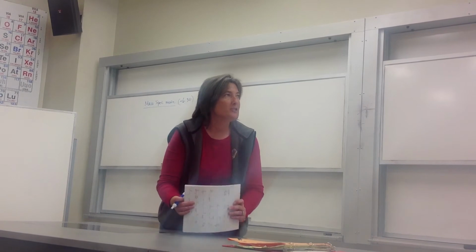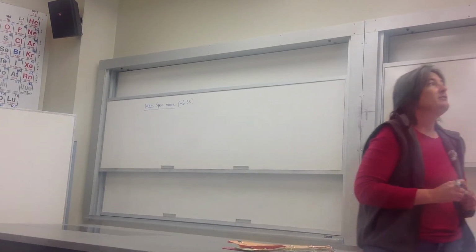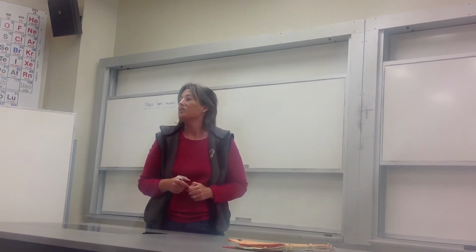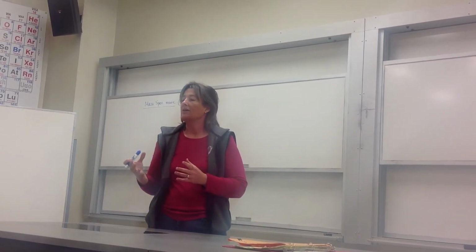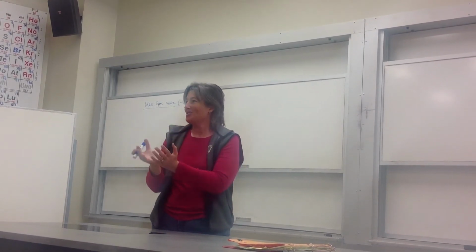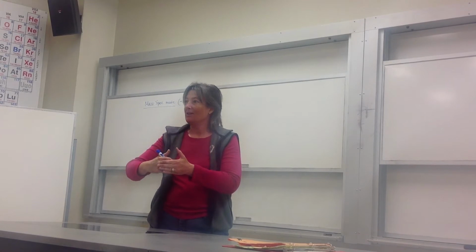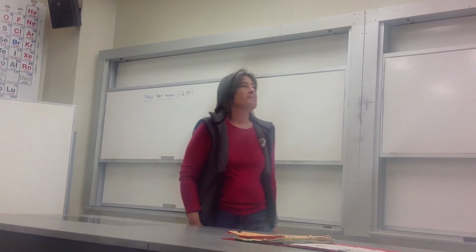A couple things about mass spec, just by way of introduction. One of the important pieces of information that it can give you, doesn't always, but it could, and often does, is the molecular weight of the sample. That's really good because if you're making something totally new and you put it through mass spec, if you know what you're supposed to have made, it's going to have a certain molecular weight. And if what you get back matches what you say it should be, that's a good sign that you probably did make what you wanted to.